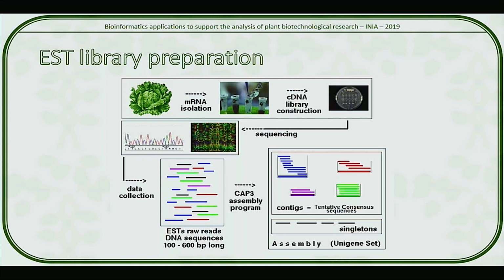We need to keep it frozen, or at a low temperature, to prevent other contaminants or other proteins from actively degrading what we're extracting. We need to use other chemicals to stop everything that could be happening inside of the cell. We need to use detergents to get rid of lipids that could be attached to the DNA or to the RNA. So all these things need to happen during the RNA extraction, and there are very elaborate protocols on how to do a proper total RNA extraction.